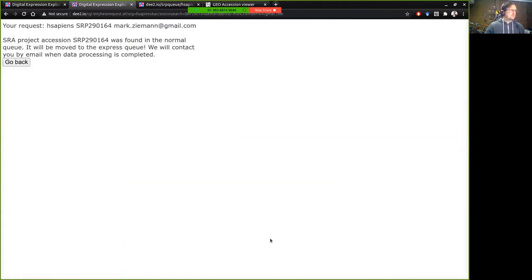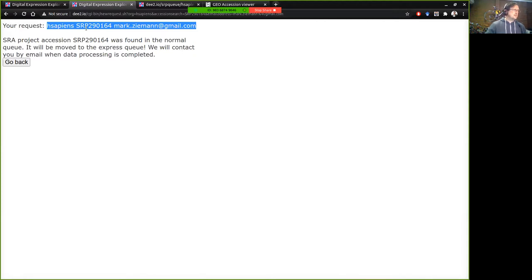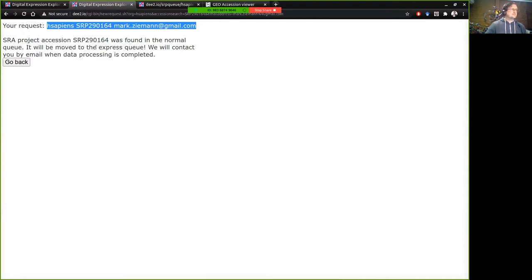It looks like that's worked properly so this is what the request looks like and that's going to get sent to our servers at Deakin University and get processed and there'll be an email when that is completed.